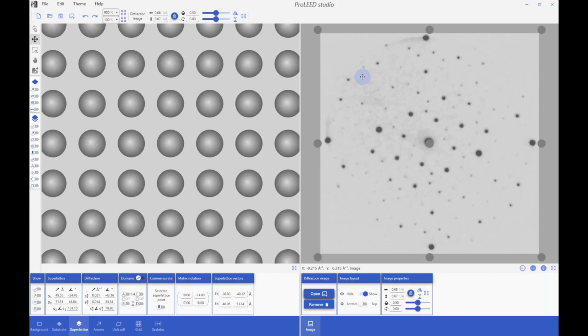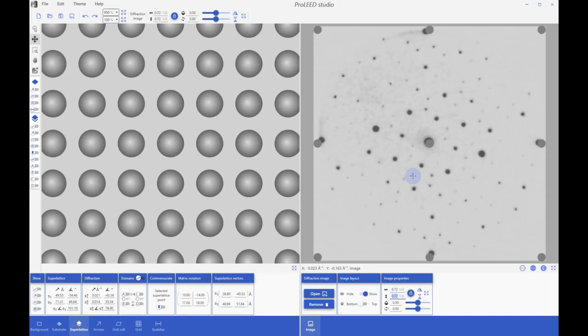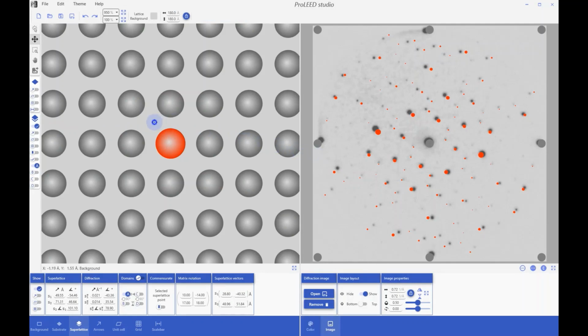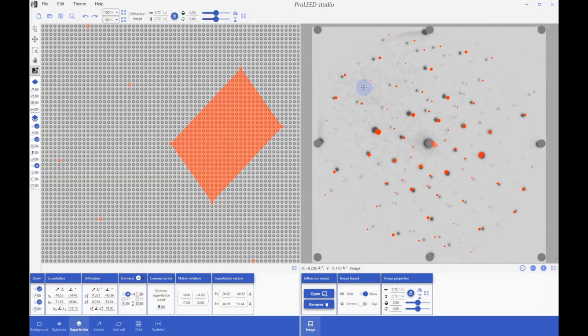spots as usual. I will show the initial superlattice model I created by simply dragging the spots and updating their size. In real space and also in the matrix notation, you can see that we are basically modeling Moiré pattern unit cell, so I will also show its unit cell. Now I will try to position diffraction image, but you can see that we still have some image distortions.